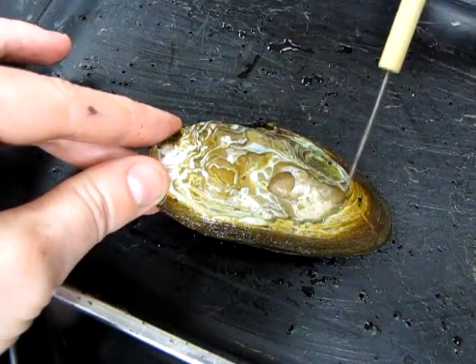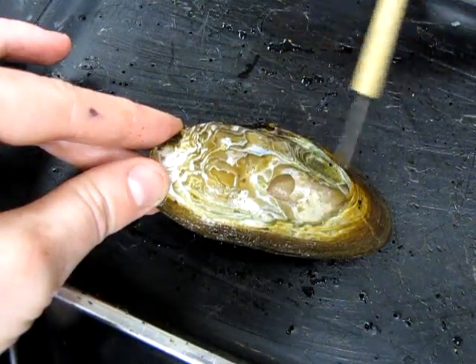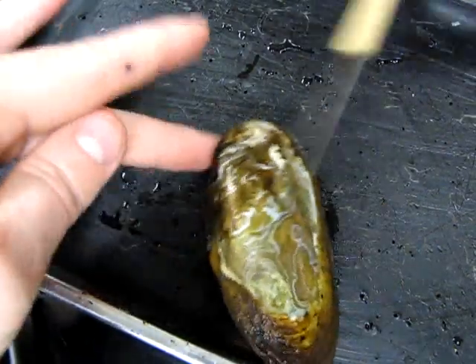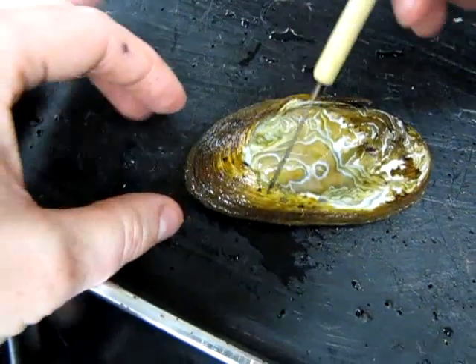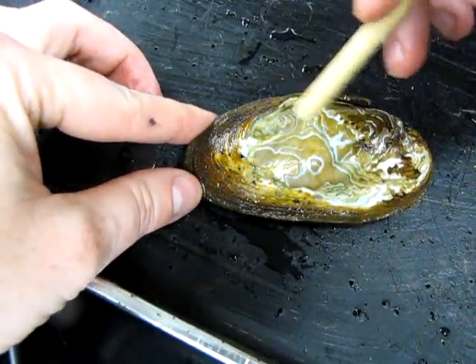The youngest part of the shell is down here. You can see these nice little growth rings on the surface of the shell — maybe a little bit better on this side. Each year a new layer of growth is added down at this side.